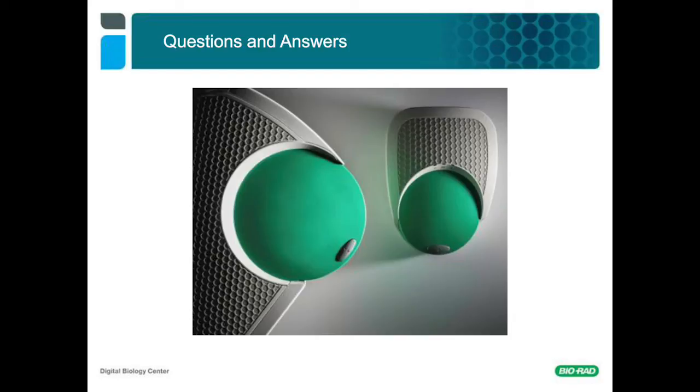Interesting question, Mohini. So not all sample preps are equal. We decided to test two sample preps which are commonly used in laboratories and are also amenable to automation. So we tested both silica columns and another magnetic bead-based chemistry. We found that silica columns actually shear the DNA pretty significantly, and we were unable to measure linkage beyond 60 kb. In contrast, with the magnetic particles, we were much more successful.